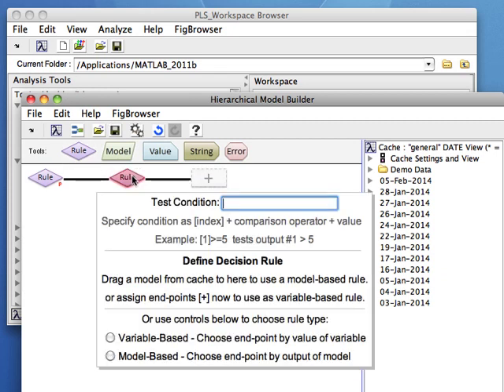Right there. And it's going to go on to this model here if the Q from the last model is greater than 12. And that's something that I know from having looked at that PCA model. I know, having looked at the residuals on that PCA model, that if I use 12, that's going to be a high enough Q value that everything from AN should go inside the model and everything else should be well outside of it.